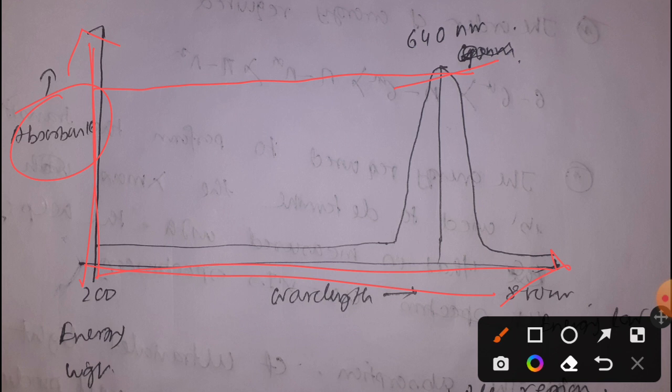Suppose we have a sample that contains impurity, but here it is the standard raw result. Raw result means that in that particular spectrum the sample is exactly pure and we have the exact absorption spectrum, right?